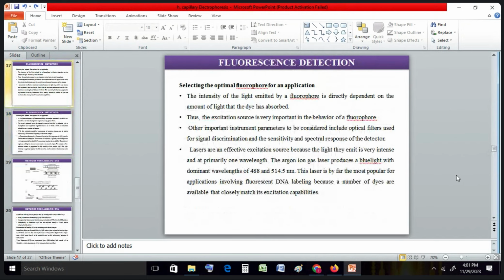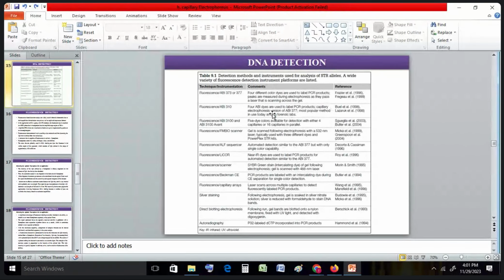And here is a list of dyes. Many different dye names are listed here. I just want you to read through this list and remember a few of the names. That's all. There are so many different dyes available now. You don't need to remember them all.